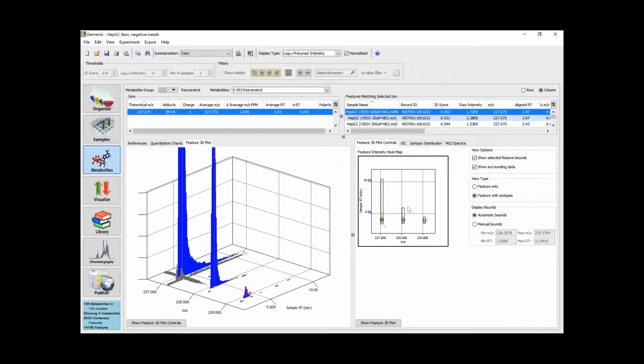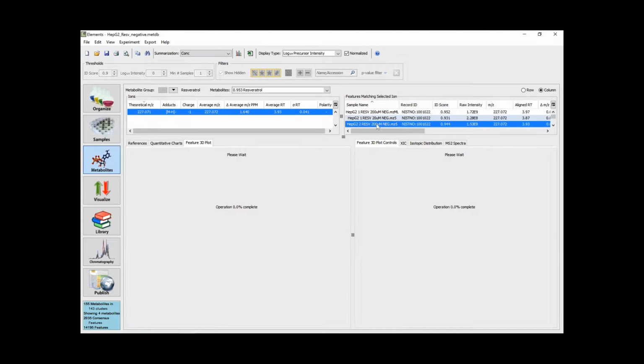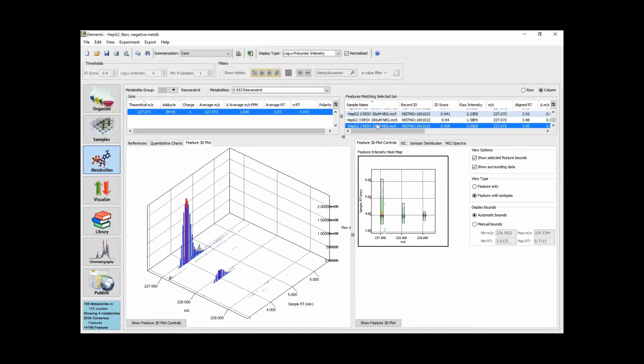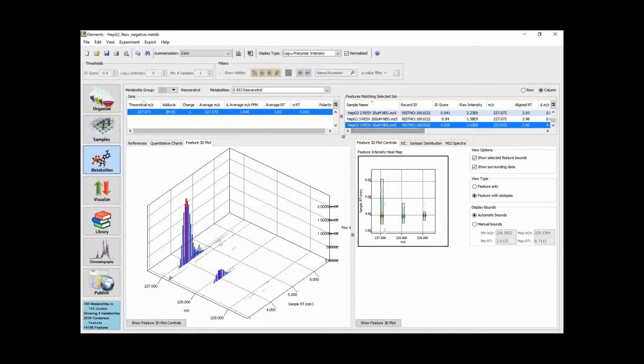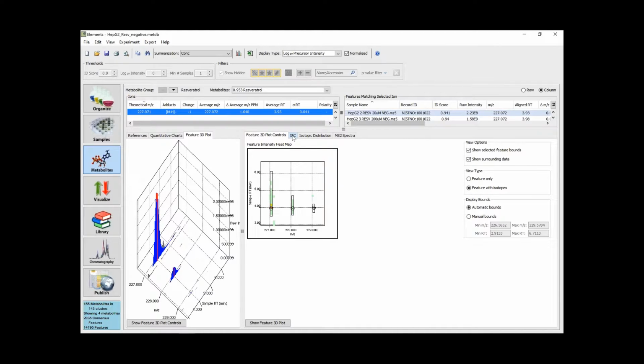Now, associated with that is this heat map, which actually shows you what peaks were picked exactly and what was integrated. Here's the box for this compound used in this sample. And you can actually go through multiple samples and look at the same types of plot to be sure that it's integrating the data right, as well as it picked the peak properly. And that's a really nice feature. Now let's go into the other side, and there's some other nice features.